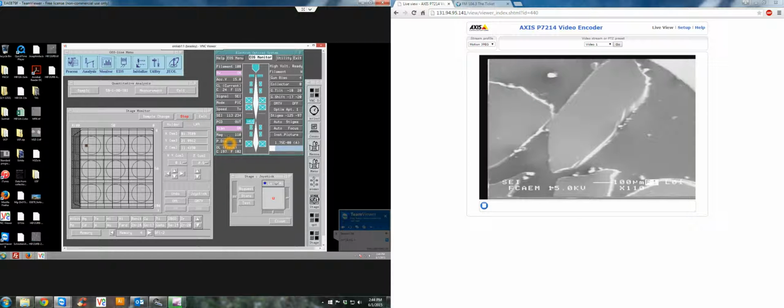And lastly, I forgot to mention that there is a possibility of reducing your magnification to 40 to get a broader view of your sample, but you have to change the scan rate to scan 2.